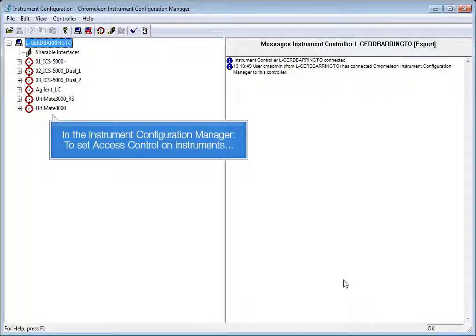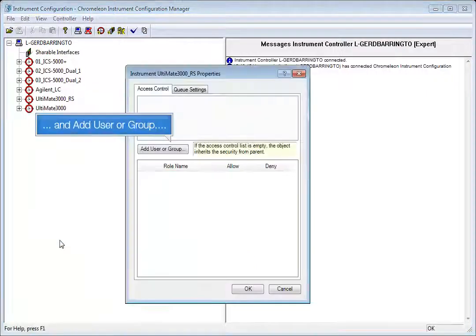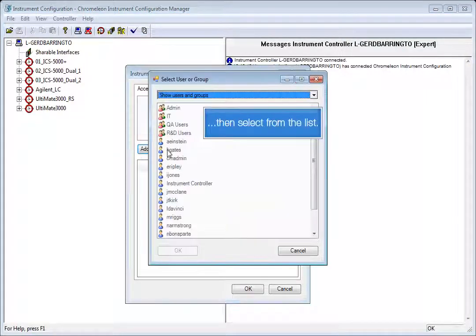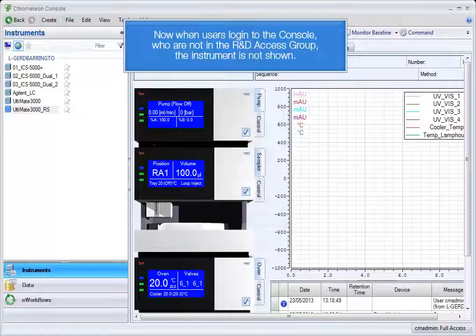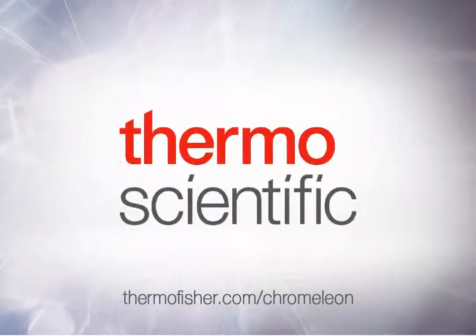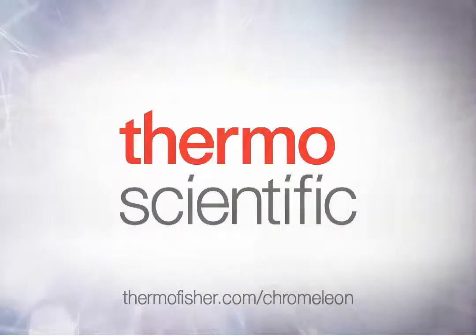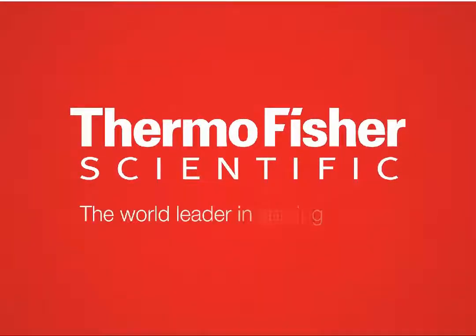In the instrument configuration manager, to set access control on instruments, open the properties and add user or group. Then select from the list. Now when users log in to the console who are not in the R&D access group, the instrument is not shown.